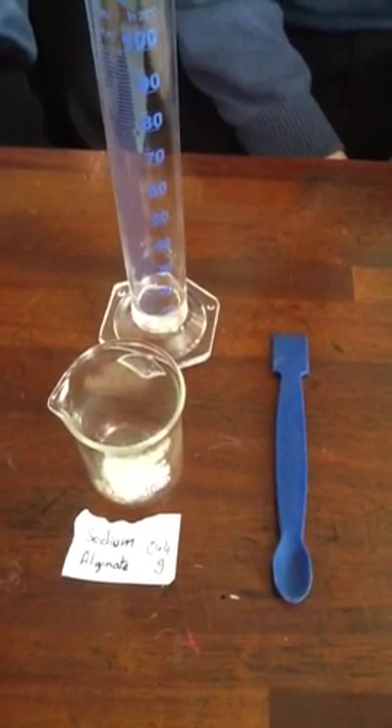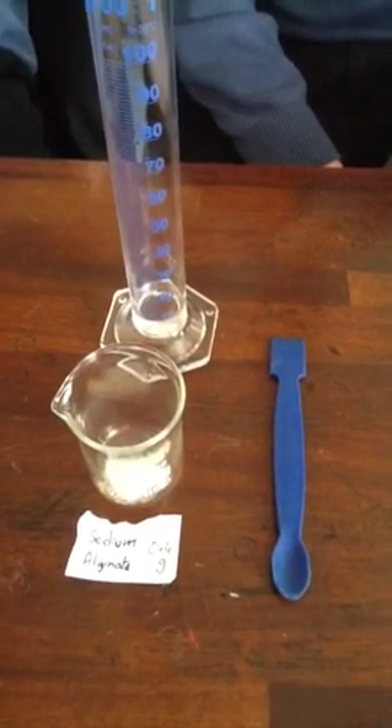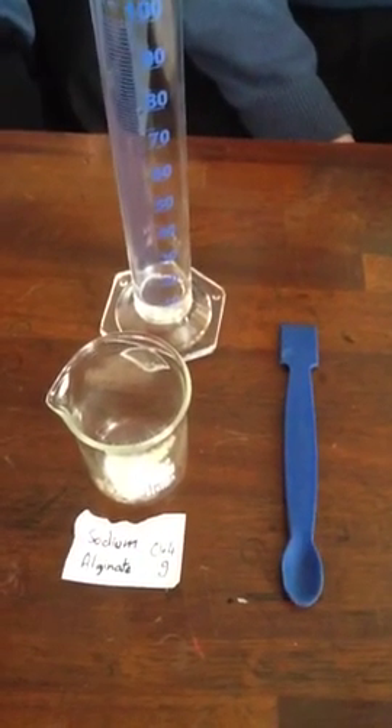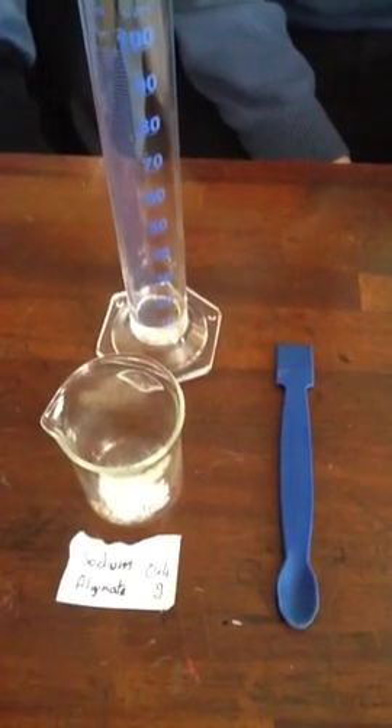This morning we are going to immobilize an enzyme, zymase, which is found in yeast. Oisin, you have weighed out 0.4 grams of sodium alginate here on the balance. What are you going to do with it now?